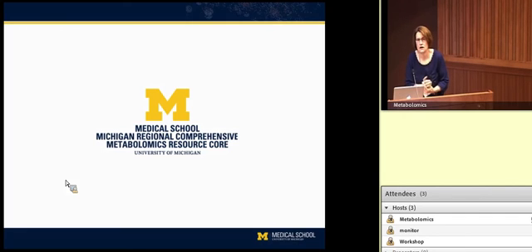Both peak area and peak height can be used for quantification. Most people use peak area for quantification. So when would be the best time to use peak height for quantification? That is a good question. I'm not sure that I can think of a good example of when you'd want to right now.